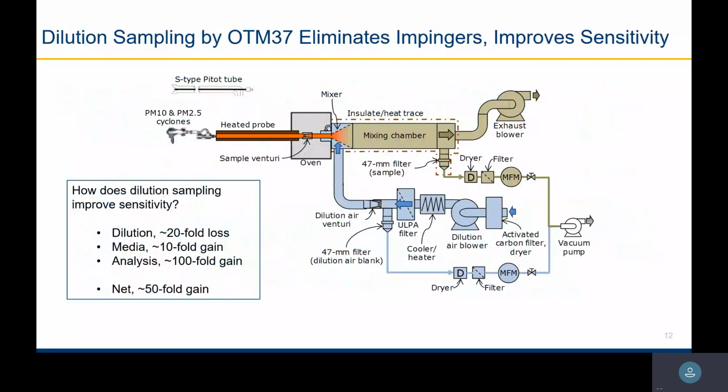So we estimate that the net of the method gives a whole gain in sensitivity. Our low detection limits that we've experienced have reflected that. So we get a much more sensitive measurement of what we have there. There's not as large of a blank that you have to worry about, where you have a lot of reagents and the precursors that are in the water.